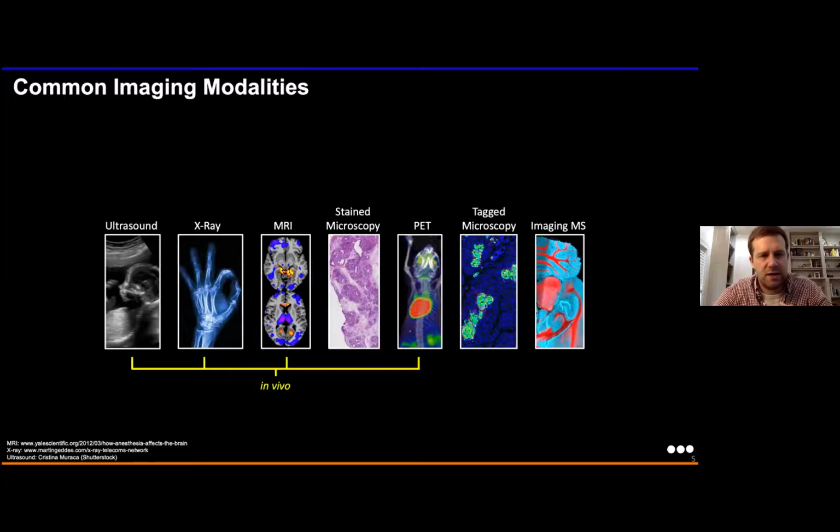And each of these certainly has their benefits, their pros and cons, things that they do very well and things that may be challenging. For example, a number of these are capable of what I would call in vivo measurements, so measurements while the subject is still alive. Others require tags. So these could be antibody tags or radio labels. And this could be kind of an extra step and maybe a detriment to the workflow, depending on what you're trying to achieve. And still others are capable of what I would call very high spatial resolution, so imaging single cells or even subcellular levels of structural detail.